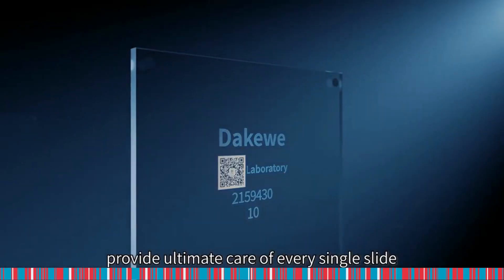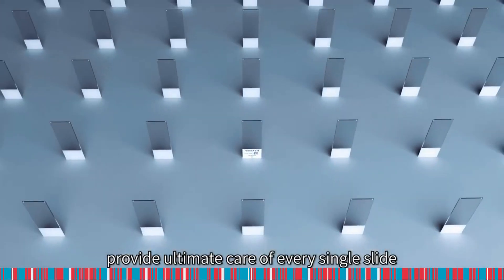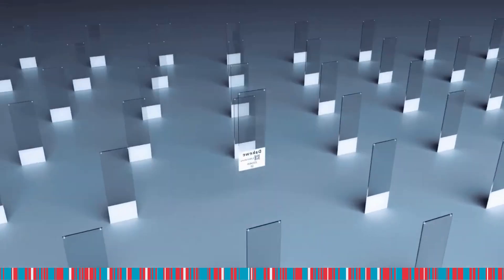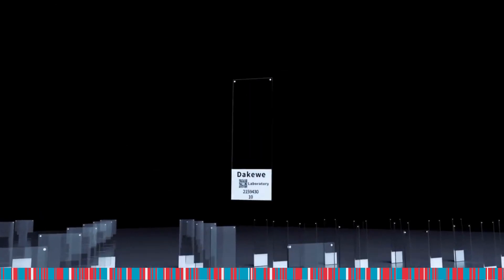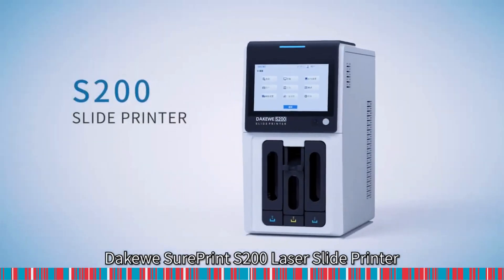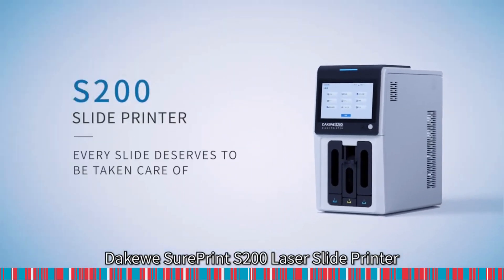An inspiring breakthrough to provide ultimate care of every single slide. An easy way for pathologists and technicians to print. Dakewe SurePrint S200 Laser Slide Printer.